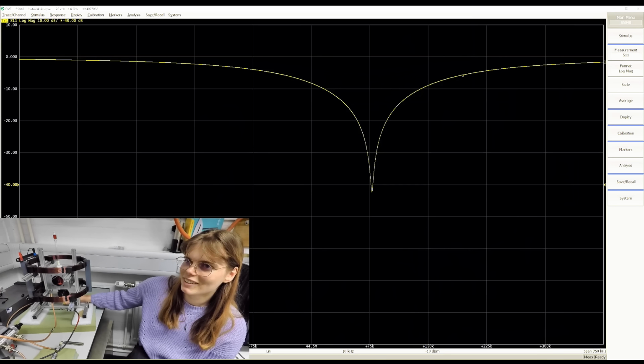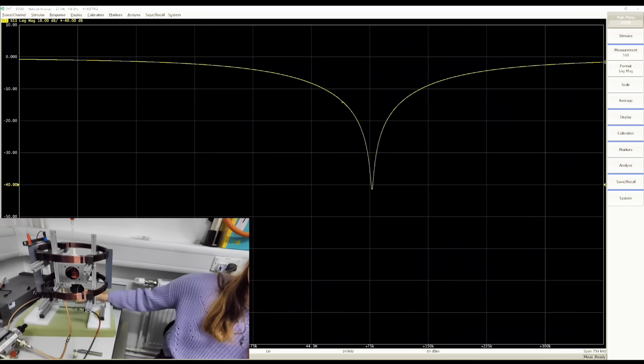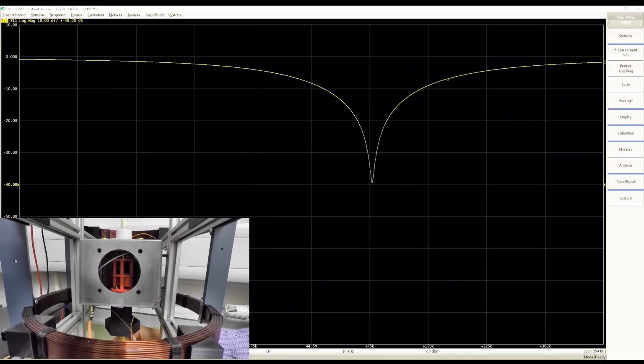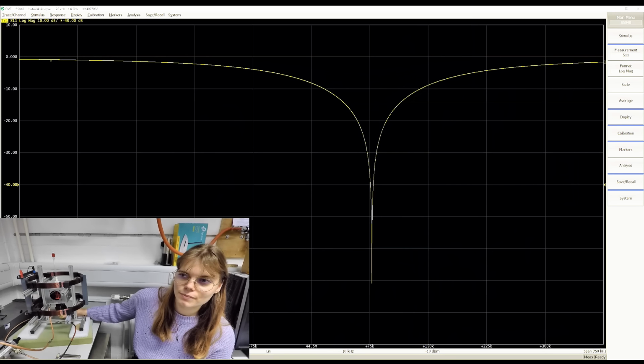And as you can see, it's a little bit more difficult to couple this than you might imagine. So as Eve is turning the differential there, that's moving the platform up inside. So as you can see, that is now nicely critically coupled.